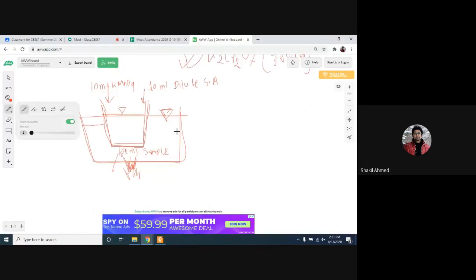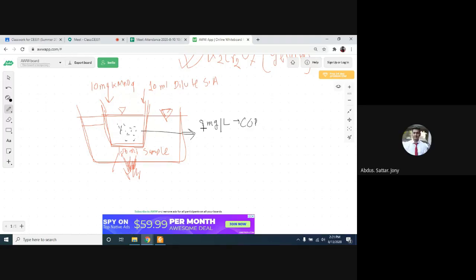Let's say, for example, you had 8 milligram per liter COD in the water. Guys, are you following me? Yes, sir.